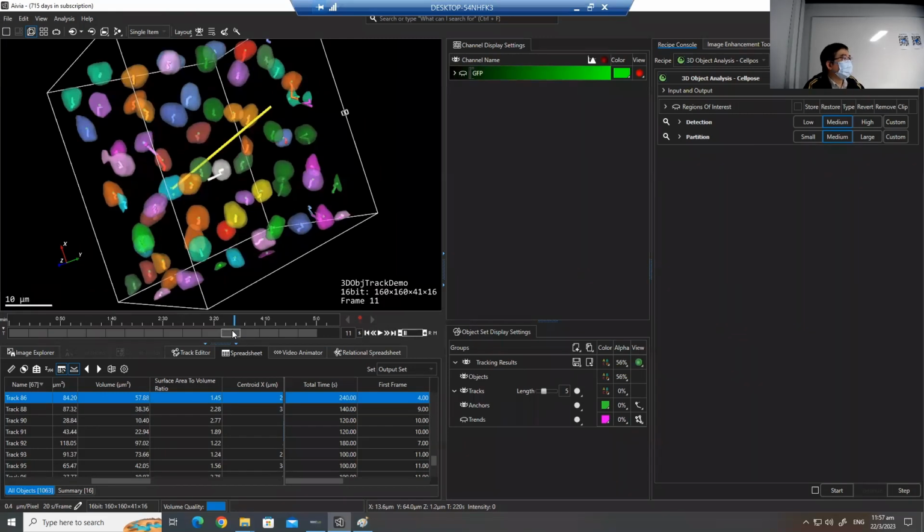We do the 3D analysis first, detect the center of mass, and then track according to the center of mass. I assume that will be kind of like one piece, but then after it breaks into pieces, that will change, like these two objects. Over time, we detect a new object. From, let's say, time point 1, this is a single object, and at time point 2 it divided in 2, so we count them as 2 different objects, so 3 different objects.